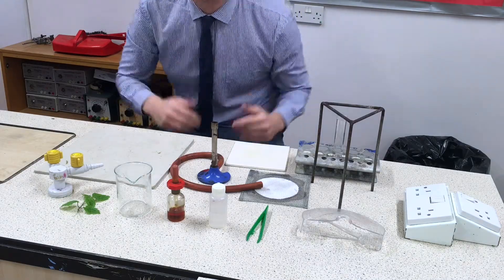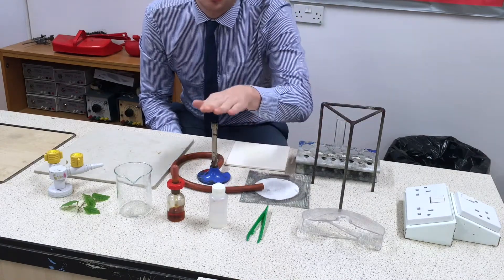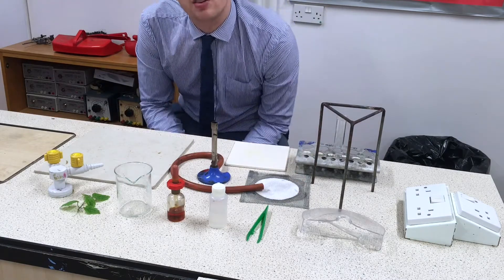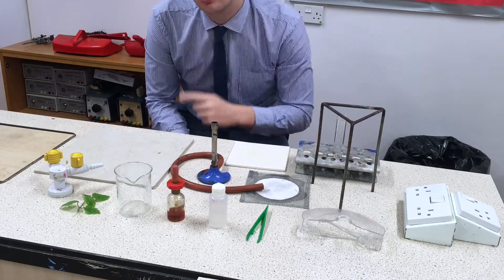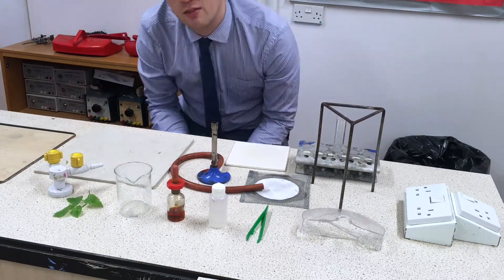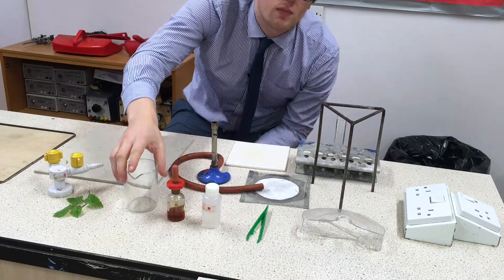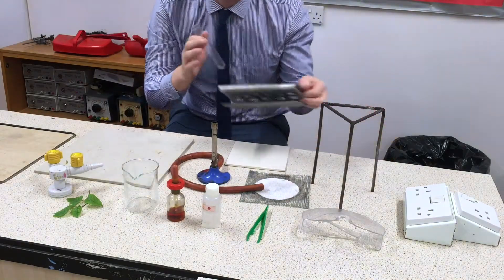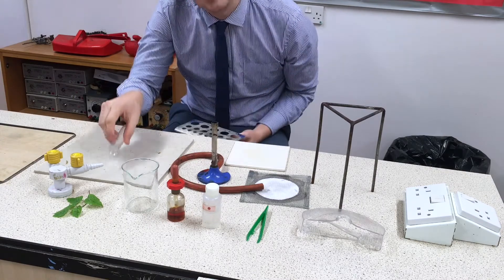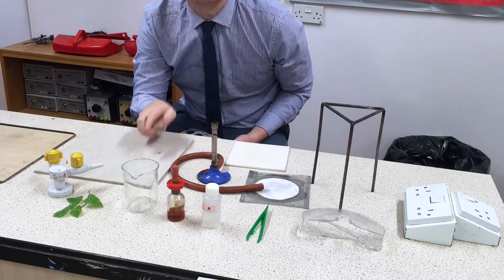For this experiment we've got a range of equipment. Our tripod, gauze, Bunsen burner, heatproof mat and goggles are our standard apparatus for heating something up in the lab. To look at the leaf, funnily enough, we're going to need a leaf — I'll just pick them from outside. We'll also need a beaker and a boiling tube. I'm going to keep the boiling tube in a test tube rack, because if it lies flat it tends to roll off the table and smash.